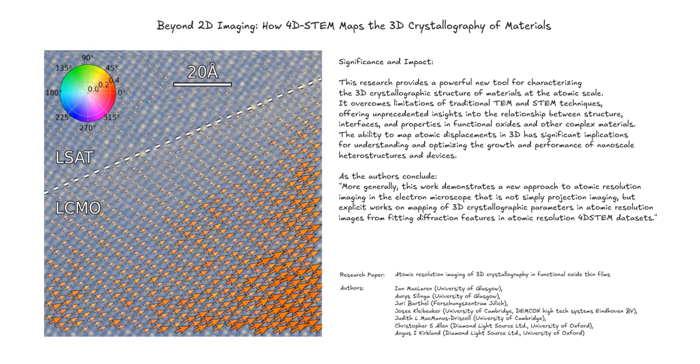Beyond LCMO, this research has broader implications for understanding other complex materials. Similar 4D-STEM methodologies can be applied to investigate the 3D crystallography of a wide range of materials, from functional oxides and high-temperature superconductors to even biological materials.